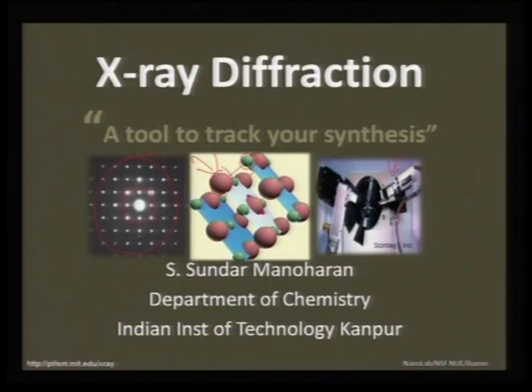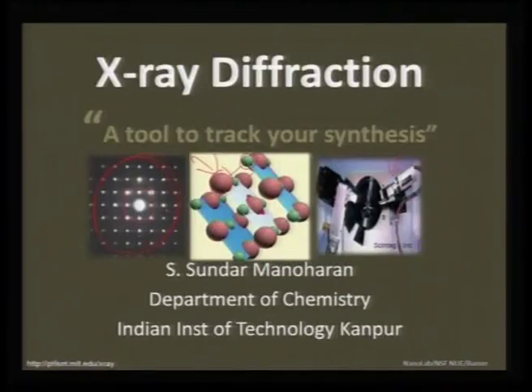We have X-ray diffraction as a tool, not just in terms of a pattern like this, but we can also try to map it as a wave, because X-ray diffraction is nothing but bending of waves. Therefore, when X-ray hits a particular lattice and if it is ordered, there will be bending of waves, and this bending of waves can be either constructive or destructive. If it is a constructive interference, then you will see an X-ray peak, and if it is a destructive interference, you will see no peak. Therefore, a constructive interference will give you an X-ray diffraction pattern, not necessarily a spot pattern, but a diffraction pattern which is more like a wave. So, you can easily understand which material or which element gives what sort of a pattern.